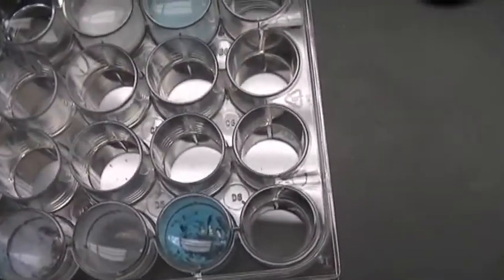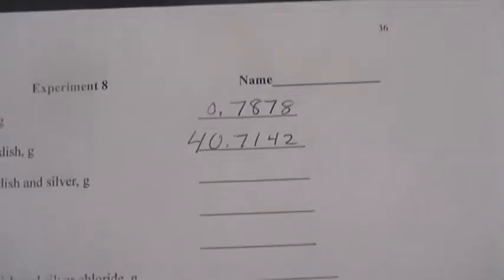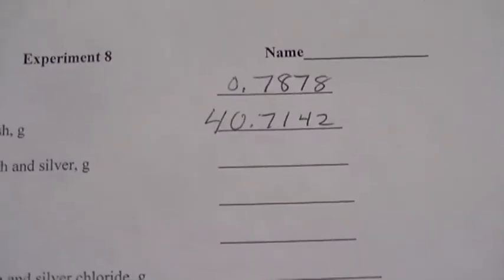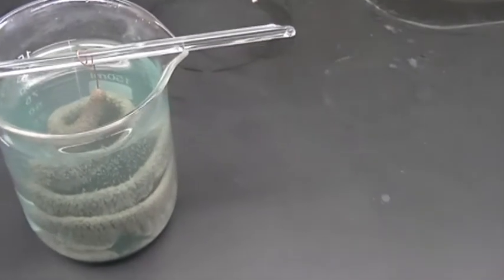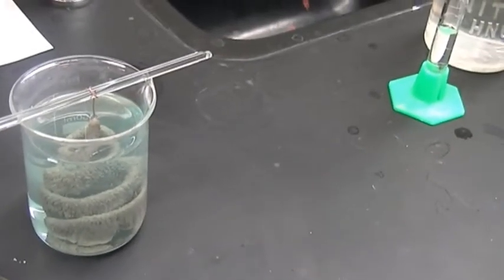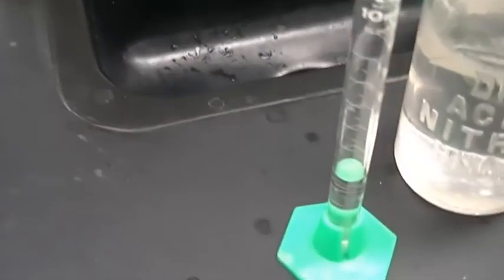All right, so the mass of the alloy was 0.7878 grams. So that was the mass of the unknown alloy that was dissolved. And then I weighed an evaporating dish. So here's our evaporating dish ready to be filled with our silver. That evaporating dish weighed 40.7142 grams. All right, so now we are going to take a bit of our solution out and test it to see if there is any silver left in the solution.